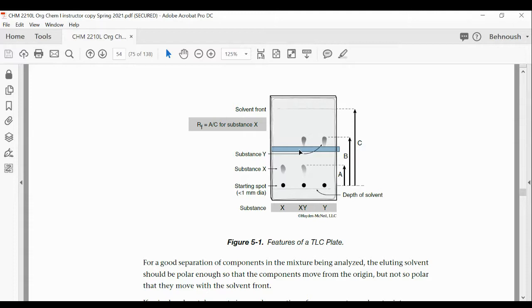So you have to follow the proper technique to have a proper separation. If your solvent is not good, you may not have vertical separation. If you use an improper depth of the solvent, then you don't have horizontal separation. That's one problem. The other problem is that you're going to get a diluted sample, and if the sample is diluted, identification is going to be hard as well.